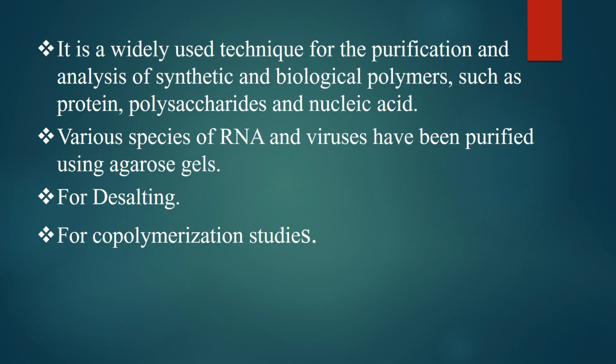It is a widely used technique for the purification and analysis of synthetic and biological polymers such as proteins, polysaccharides, and nucleic acids. Various species of RNA and virus have been purified using agarose gels for desalting for copolymerization studies.